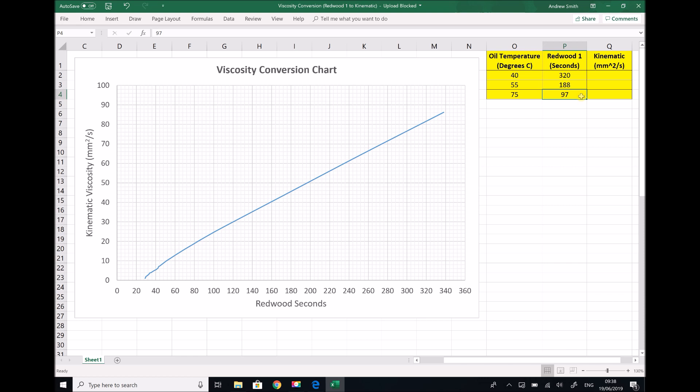All that's left to do is use our conversion graph to convert these Redwood seconds into kinematic viscosity in centistokes or millimetres squared per second. On our axis for Redwood seconds we track upwards until we strike the conversion line, then track to the left. In this case, with each increment being 2, we get a kinematic viscosity of 82 millimetres squared per second for 320 Redwood seconds.